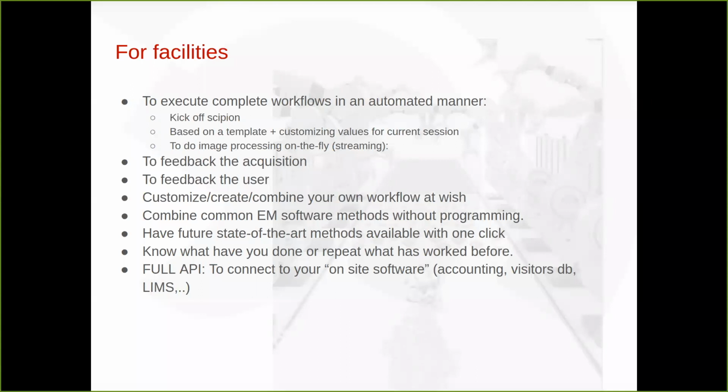But also you can feed back to the user, and the user might not be in the facility, maybe at home, but he can also get information extracted in an HTML report that describes the acquisition.